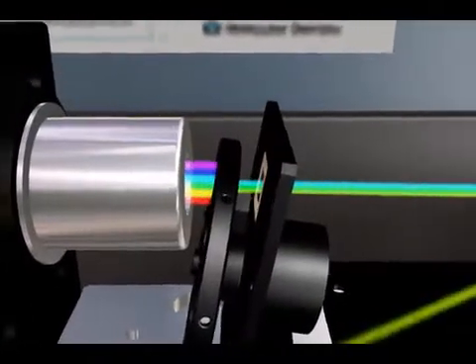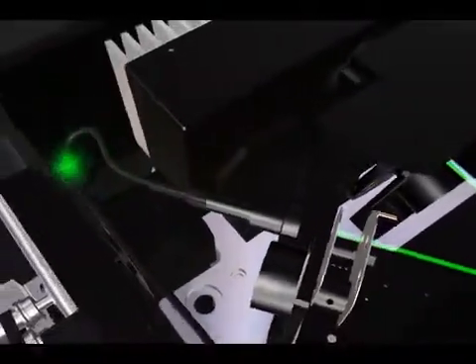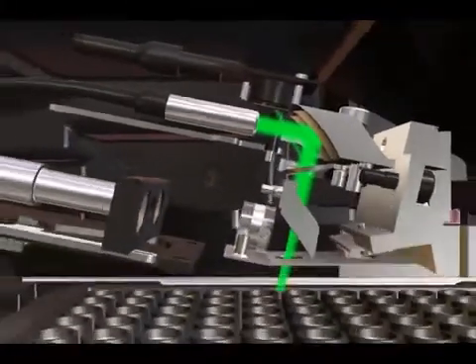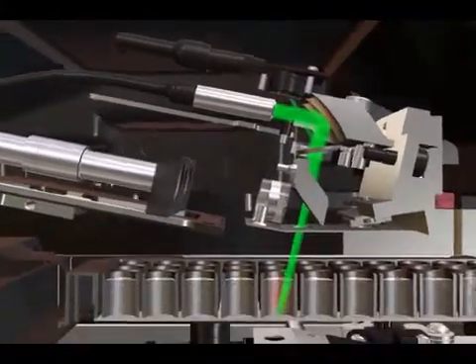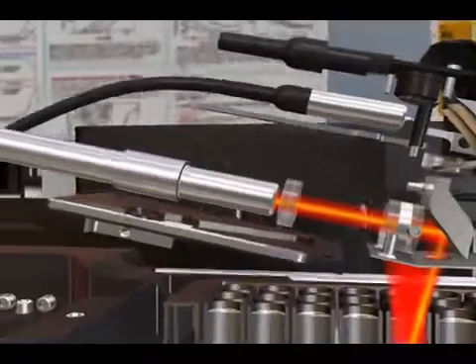It's all automated. The heart of the SpectraMax is its unique dual monochrometer wavelength selection system. Filters are best at restricting non-target wavelengths. Monochrometers are best at selecting a specific wavelength. Our high-efficiency integrated monochrometer and filter optics enables high precision and maximum flexibility for the widest variety of assays.